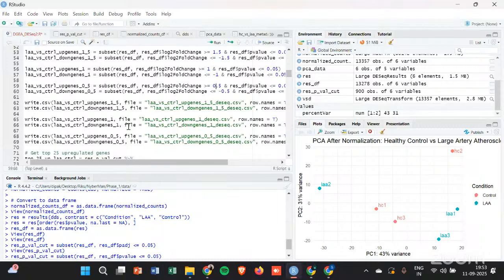There is no defined criteria for that. It will be completely based on your experiment. As I said, you should be aware of what setting a p-value means. If you are setting a p-value of 0.05, that means you are okay with making an error 5% of the times.